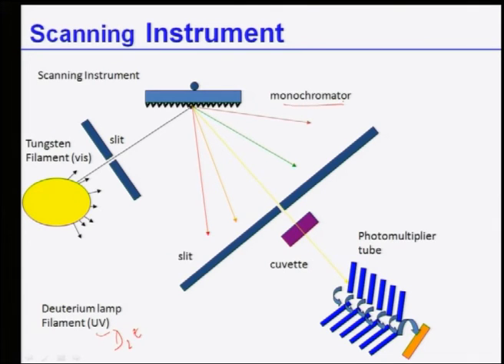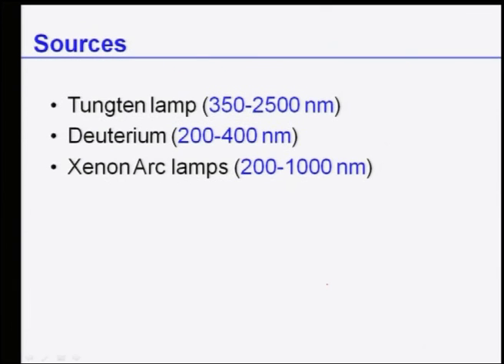How the monochromator works is basically with crystals, basically Bragg's law. I will tell you how it works. There are crystals, which you can orient, scan, and move. When you scan this, there is a slit here, so only a particular wavelength will pass through the slit and fall on the sample cuvette. Then you have a photomultiplier tube which will determine whatever radiation is coming out. Very simple.